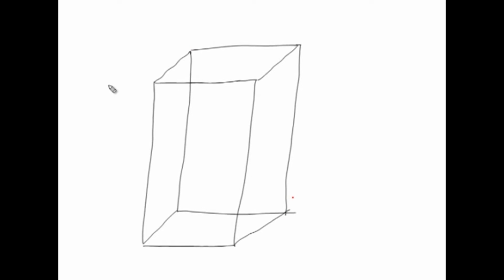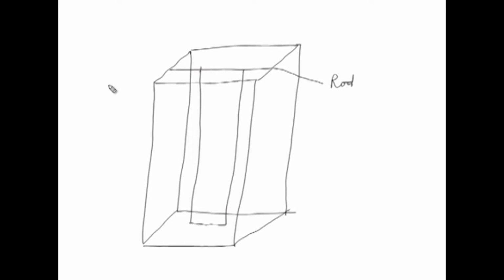You have a container here, and in this container you have a paper. This is a rod to support the paper. The paper is hanging, or it is supported so that it can remain straight in here. This jar has to be sealed completely. The main aim of having a rod or a support system is to keep the paper straight.